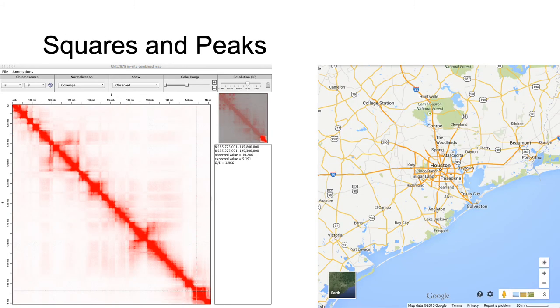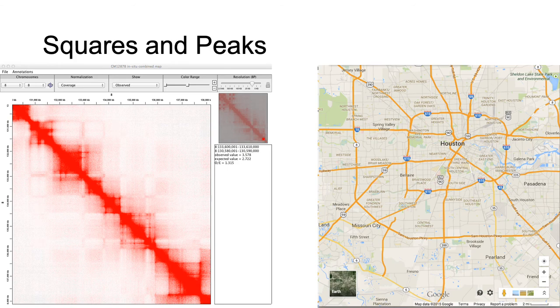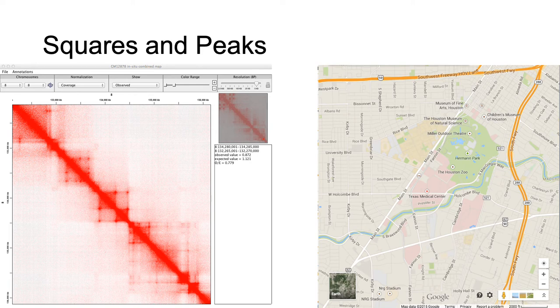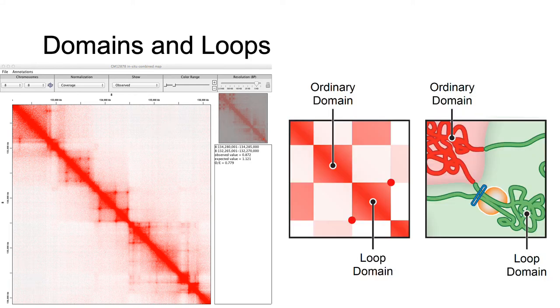As we zoom in further on the contact map and on the city of Houston, we see more features emerging. We see squares along the diagonal and peaks off-diagonal, regions of enhanced contact. These correspond to chromatin loops and domains.